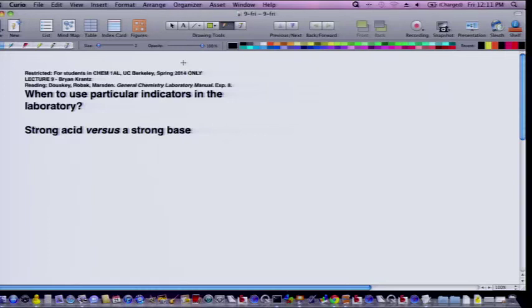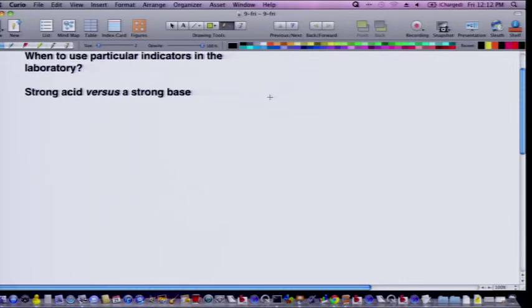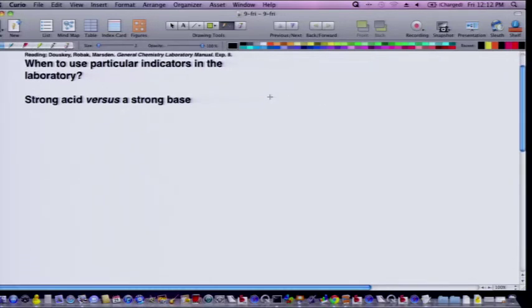So just turn in the sheets at the back of the pre-lab sheets, and we will grade those like we normally did. Please, if you're having trouble with any of the calculations, contact your GSI about those pre-lab calculations, because those are really important for being able to do your experiments. You don't want to weigh out like 10 times more than what you need. Of course, hopefully the GSI won't let you do that.